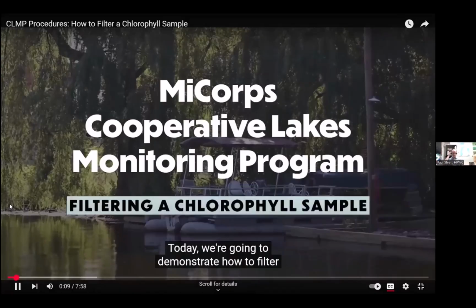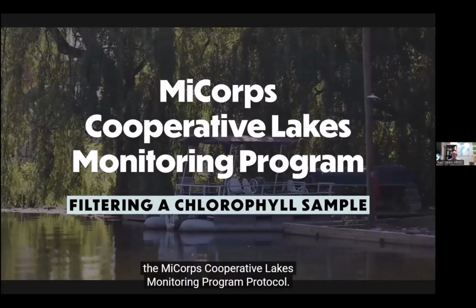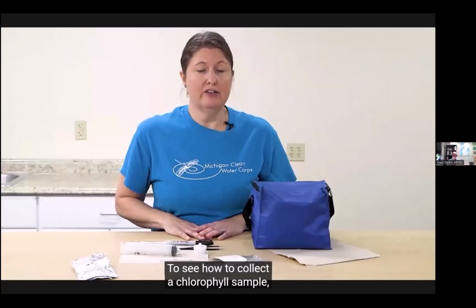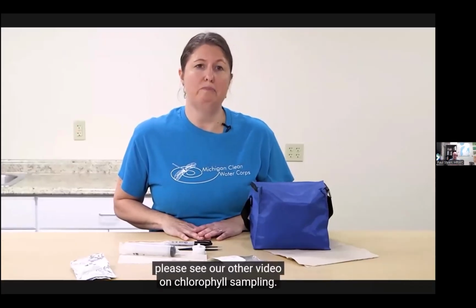With the Michigan Department of Environment, Great Lakes, and Energy. Today we're going to demonstrate how to filter a chlorophyll sample using the MiCorps Cooperative Lakes Monitoring Program protocol. To see how to collect a chlorophyll sample, please see our other video on chlorophyll sampling.